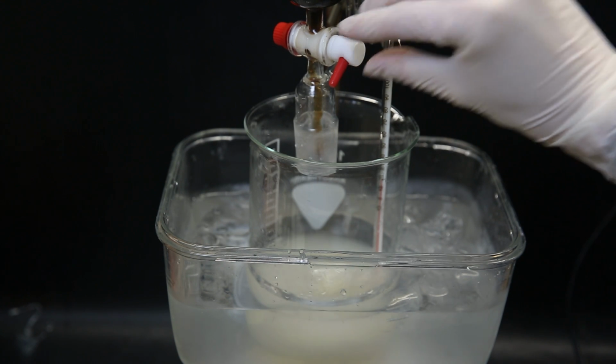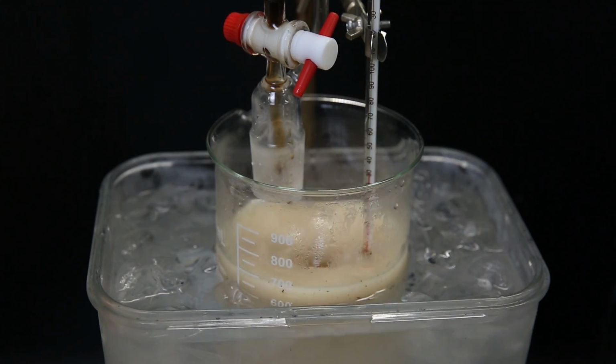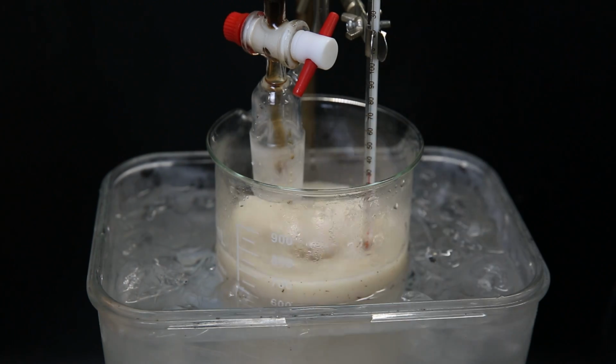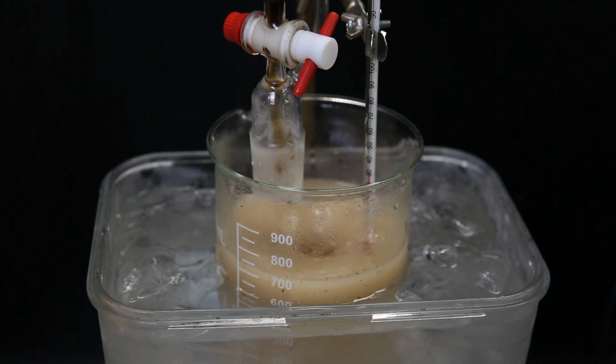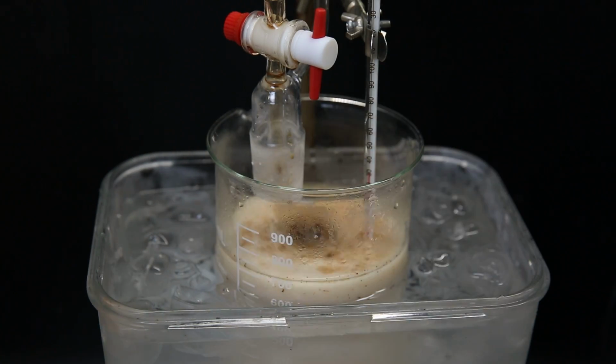I make sure that the temperature is at or below 30 C to prevent any degradation. I occasionally add more sodium hydroxide solution to keep the pH basic to destroy all the sulfuric acid and keep the product deprotonated and in suspension. When all of the black mixture has been added, it is finished and the resulting mixture has a basic pH.